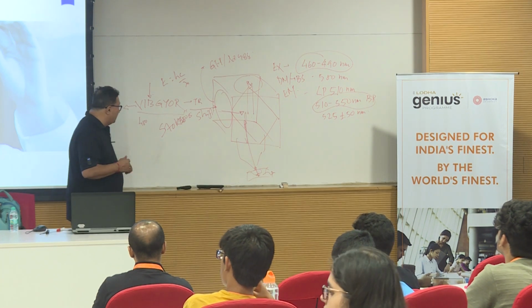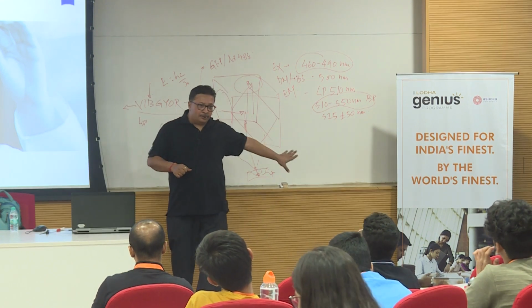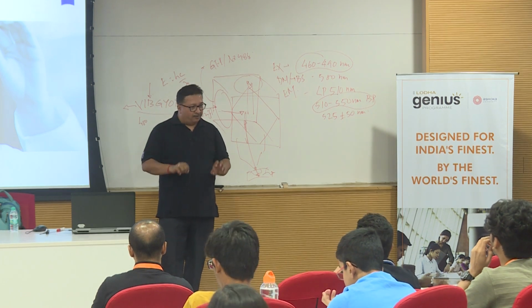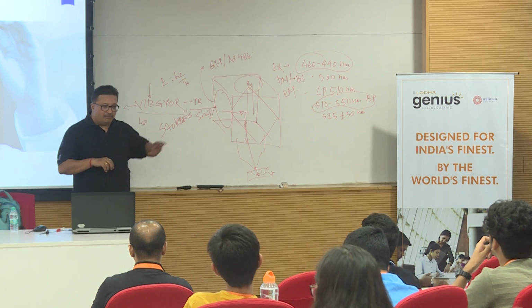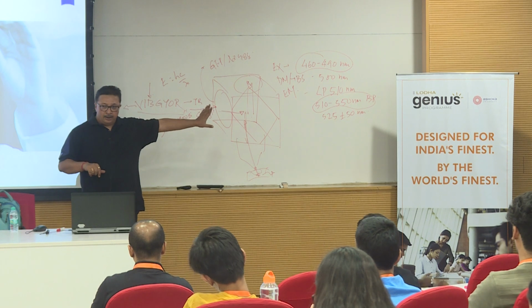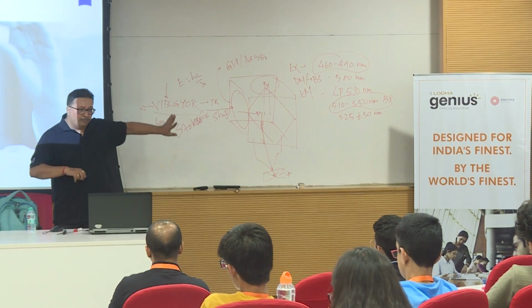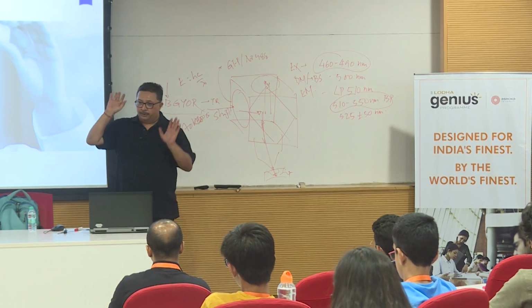So now it turns out that with a fluorescence microscope, unless and until my sample is very fine or very thin, I will always get that haze information. It's never possible to generate an image free of any haze. When we come to a confocal microscope, it does some magic. Your confocal is nothing but an extension of a fluorescence microscope.